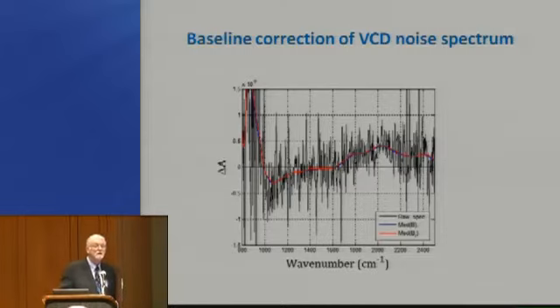Bruce has a question. You addressed this issue of whether your algorithm changed band shape, and it did look like you were pretty good about preserving intensities. But have you looked at a case where you've got a spectrum with radically different intensities and band widths? Does it make any difference if you've got really broad stuff someplace, really sharp stuff in another? And are you confident that you maintain intensity? That was where we were looking when we were looking at the methanol spectrum, where you had that broad OH.